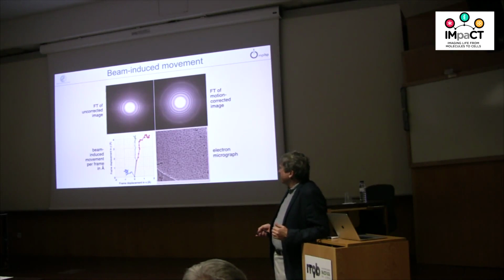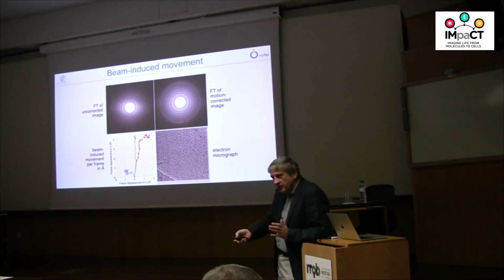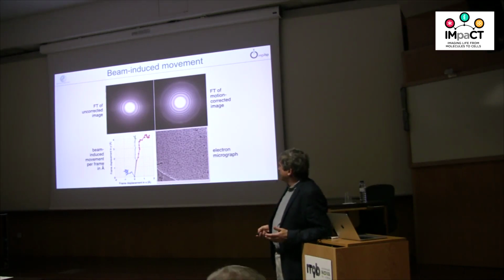So this is what happened, and we used to throw out 95% of the images that we took because they were suffering from this effect of the specimen moving while exposed. And these new cameras, not only are they very much more sensitive, they're also faster.